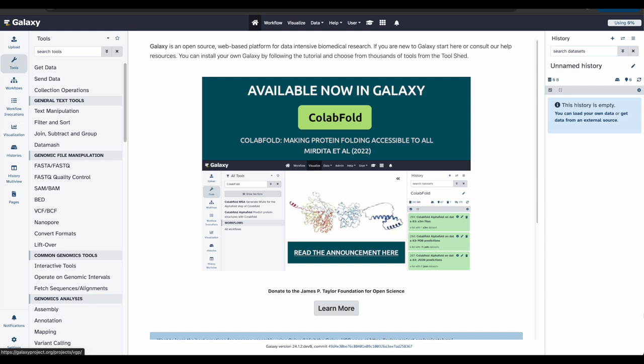If this is your first tutorial with us, welcome to the Galaxy community. Today, I'm going to be walking you through the Galaxy Basics for Genomics tutorial.